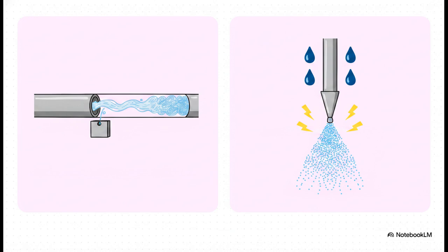But liquid chromatography mass spectrometry, LCMS, is a whole lot trickier because, well, we're dealing with liquid solvents. It requires a very specialized interface that directly couples the HPLC instrument to the mass spec, meticulously stripping away that solvent and transitioning the analyte molecules into the gas phase using really clever techniques like electrospray ionization.